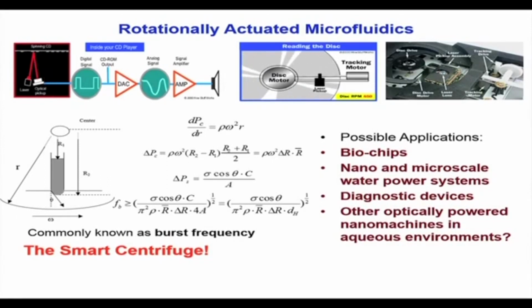The radially outward force will increase beyond the critical angular speed, and it will increase sharply because it will scale with omega square, the square of the rotational speed. So beyond the critical rotational speed, the centrifugal force will overcome the surface tension force, and at that speed the fluid will start moving. Why are we not bringing the viscous force into that analysis? The reason is simple: the fluid has not yet started moving, we are thinking about the forces acting on it, and when the fluid has not yet started moving, viscous force has no role to play.